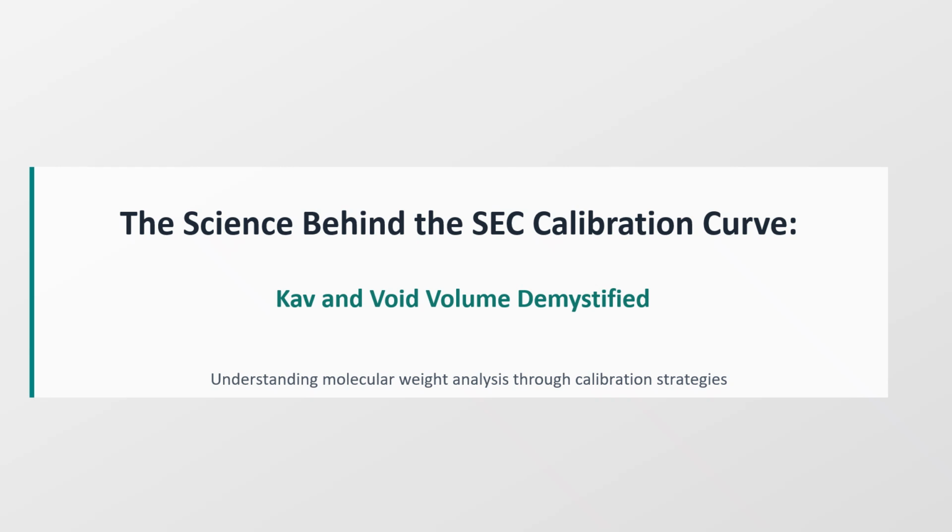Let's start with a simple but powerful idea. Every SEC chromatogram tells a story, but only if we know how to read it correctly. When analysts talk about size exclusion chromatography, we often jump straight to molecular weight numbers, calibration curves, and reports.